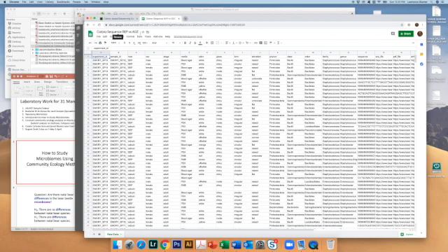Okay, so you've saved the file. Presumably, right now this file is saved on your Google Drive. It's not on your computer. It's in the cloud. The next step you want to do is go to the tab, and there's a little down arrow. You want to click on that arrow and say copy to, and you want to copy this to the existing spreadsheet. That is, we want to create a new tab with an exact copy of all of these data.